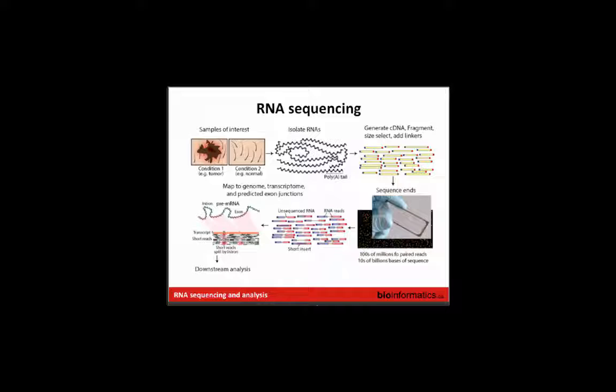Because there's a feeling that we've gone down this road of optimizing for microRNA sequencing and optimizing for mRNA sequencing, and there are some orphaned medium to small sized RNAs that are getting lost. But that area, I think, is still quite novel in terms of capturing those things effectively. There are no well-established protocols yet.